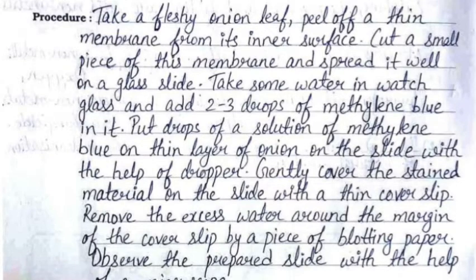Put drops of the methylene blue solution on the thin layer of onion on the slide with the help of a dropper. Gently cover the stained material on the slide with a thin cover slip. Remove the excess water around the margin of the cover slip using a piece of blotting paper.